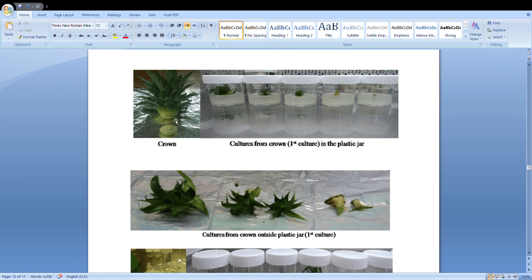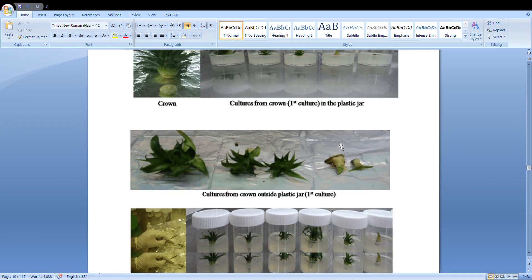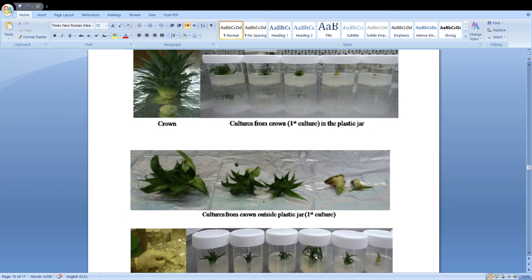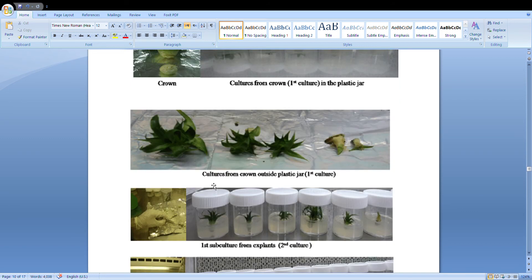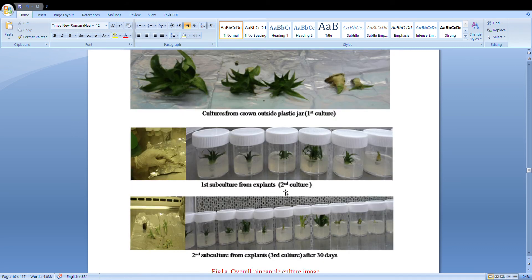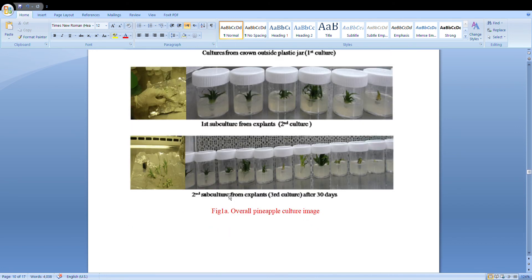Here we can see the images. This is the crown we used for this experiment. This is the first culture on the crowns, cultured in a plastic jar. Then after 15 days we did the second culture — these are called subcultures. Then the third subculture after 30 days. This is the overall image of our pineapple culture. In the laboratory we produced shoots, and after subculture the third subculture was completed at 30 days.